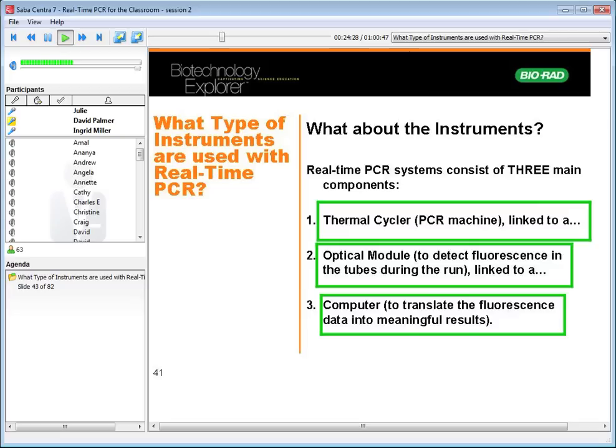And if the curves aren't S-shaped, sometimes curves can have really strange shapes. Maybe it's not actual PCR products at all. Maybe PCR didn't even work and it's just a sample that's evaporating that you're seeing causing the fluorescence to change. Or it could be fluorescence drift in unamplified samples. The SYBR Green may be bleaching out. But in any event, there's something seriously wrong with the assay if you don't see those sigmoid curves.